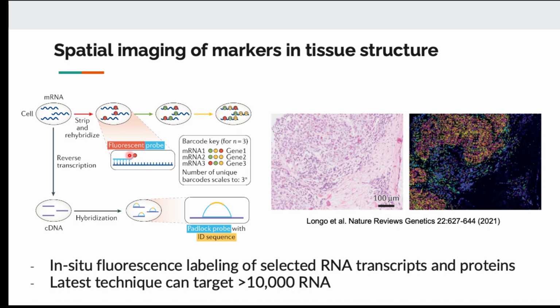In microarray, we design multiple probes per gene to get more hybridization. In this case, they're going to design their probes so that each gene can be bound by multiple probes. So at the end, if we focus on the diagram here, each RNA molecule will be bound to multiple probes.